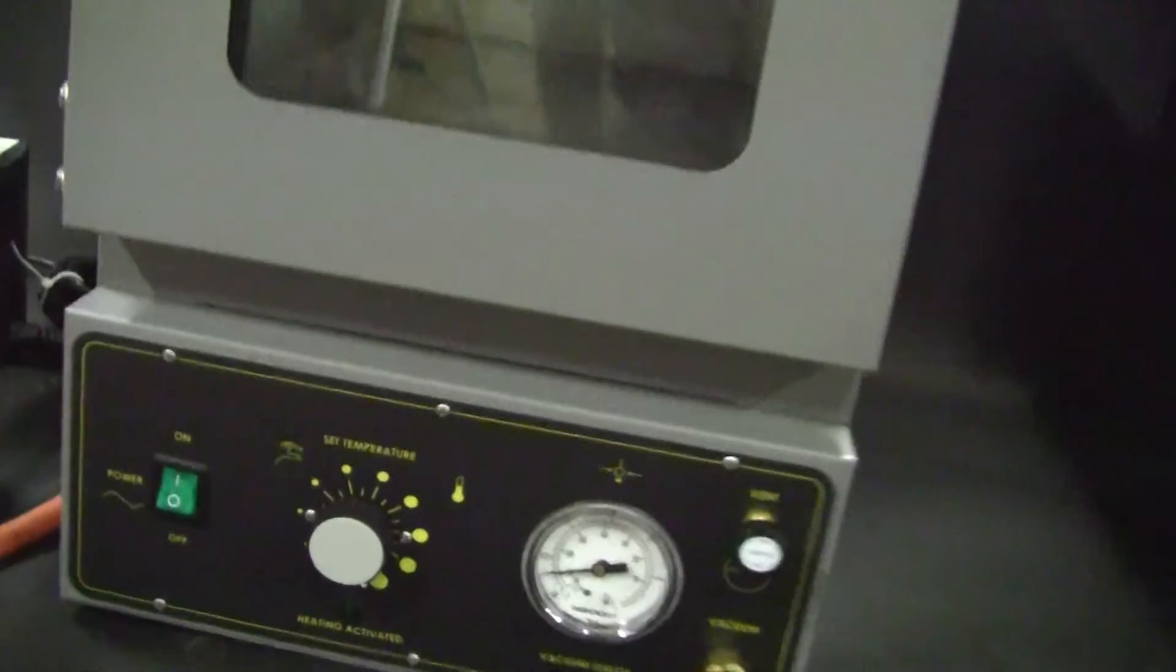This is the smaller 9x9x12 vacuum oven, 0.6 cubic feet. It's brand new.